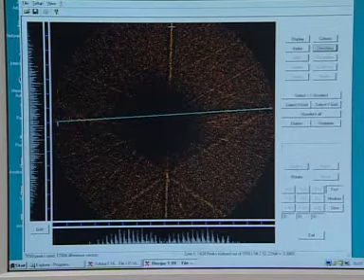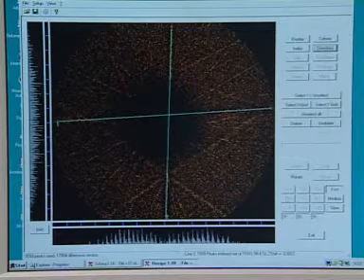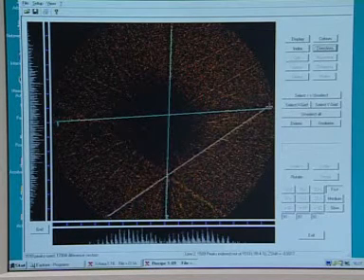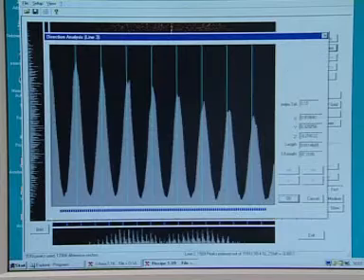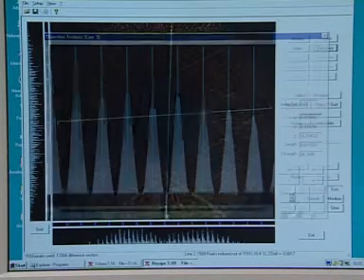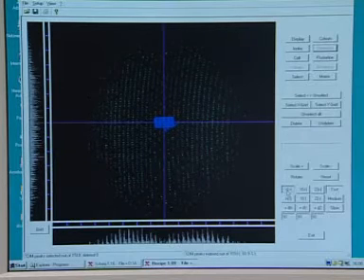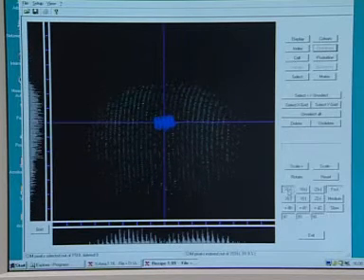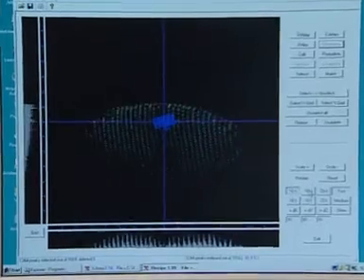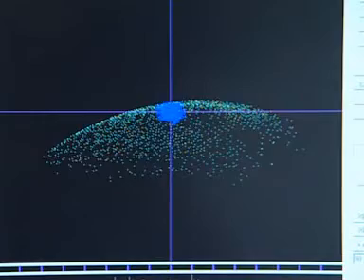The field of X-ray waves diffracted by the crystal contains the information about the three-dimensional structure of the protein molecule in two components, namely intensity and phase. Only the intensity can be measured directly by the detector, while the phase must be reconstructed in a suitable way for the structural solution. In ANCAR, the rather modern multiple anomalous dispersion, or MAD, process is used for this purpose.